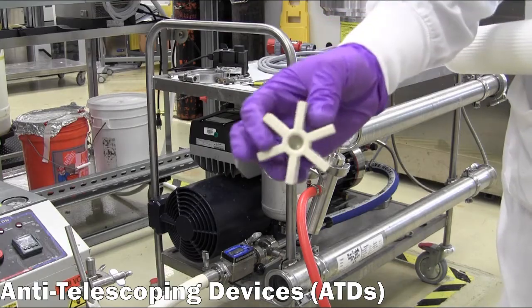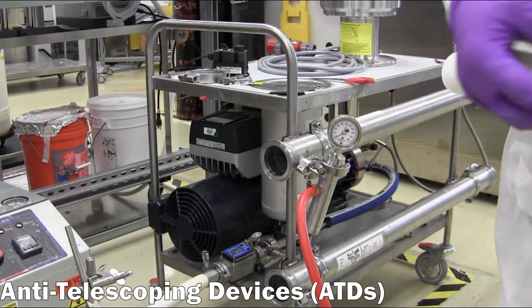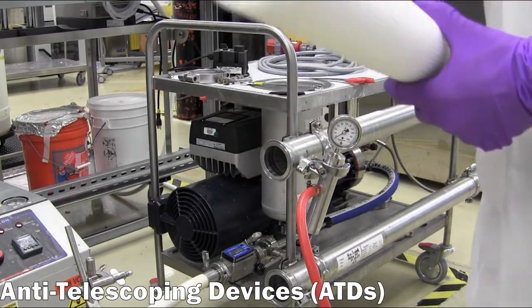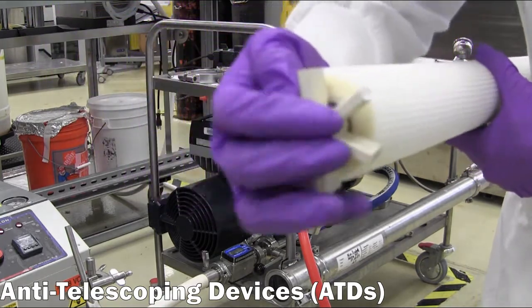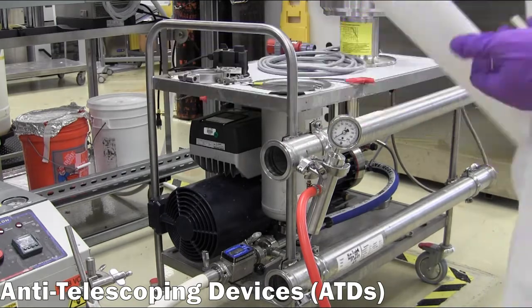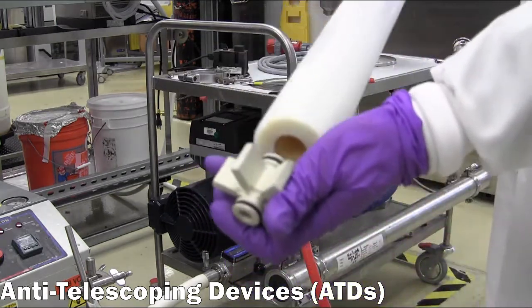The ATD, or anti-telescoping devices, are installed on the membrane. The ATD with a blank is inserted on one side of the membrane, then the ATD with a connection is inserted into the other end.